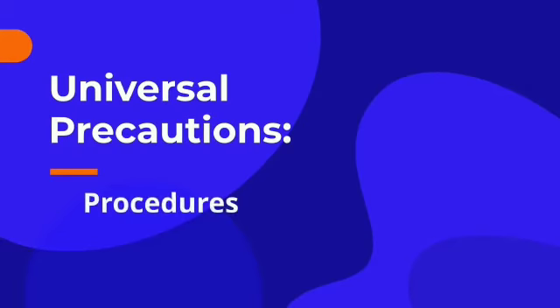Today I will show you about universal precaution procedure for infectious fluids. Enjoy watching. Procedure to implement universal precaution. Correct use of universal precaution procedure can greatly reduce your risk of exposure to infectious fluids.